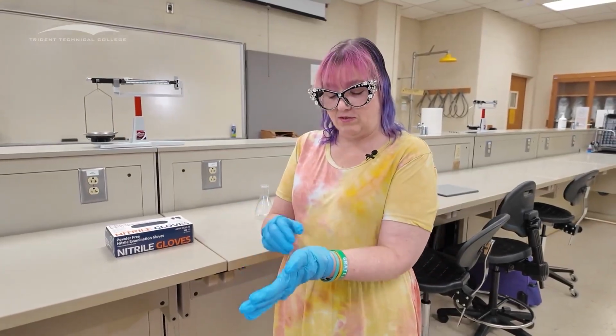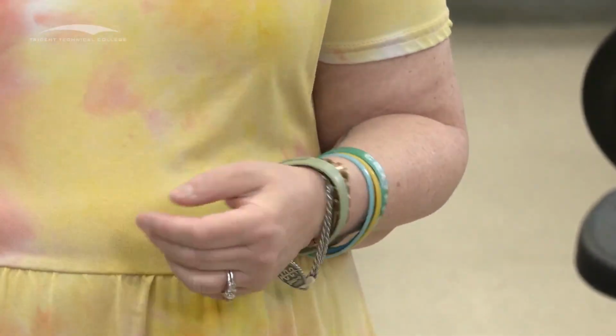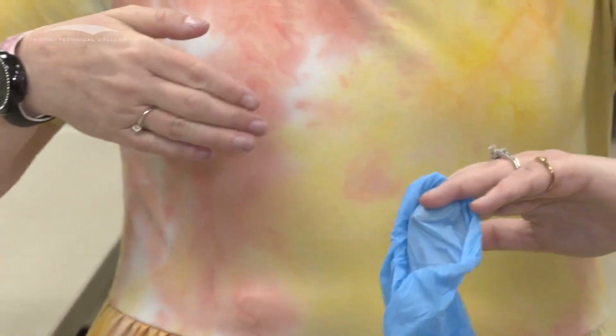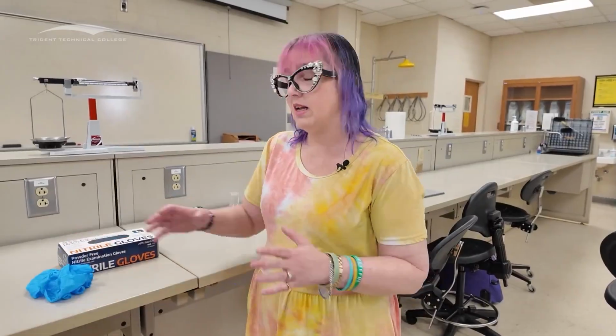So if I'm going to take these gloves off, I can take the first one off fairly easily, right? Fairly simple. But when I go to take the second one off, I want to hook my fingers inside of it, grab hold of the inside, and then pull it off like that so that I'm holding the inside when I'm dealing with it, not the contaminated outside part of the glove. And then I take those off.